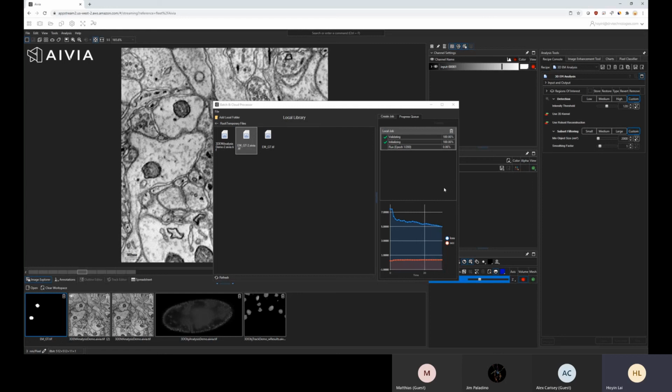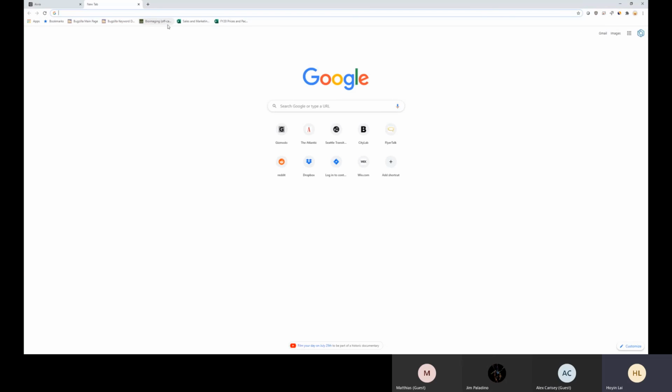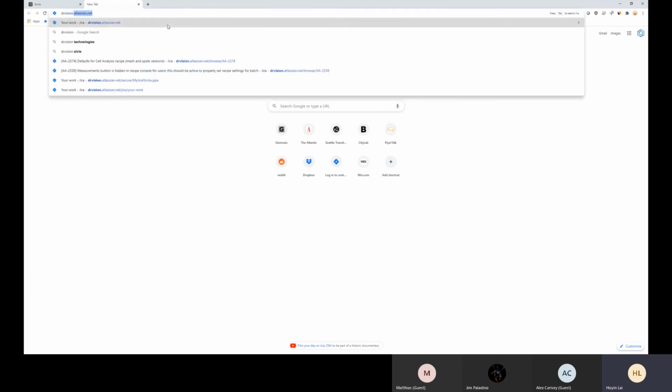Let's say for your raw data, you can have one that is 512 by 512, and then another one that is 1024 by 1024. As long as the ground truth for those matches the raw input, you're okay. Okay, I get it. Yeah, and I think we have mentioned this in our wiki as well.